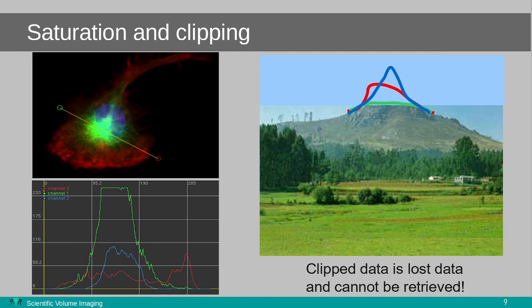Make sure that during acquisition you try to do your best not to oversaturate the camera detector. It can only detect intensities between certain intensity levels. Larger signals above its limit can saturate the sensors and might not be accurately recorded. This is called clipping, and you effectively lose contrast information.